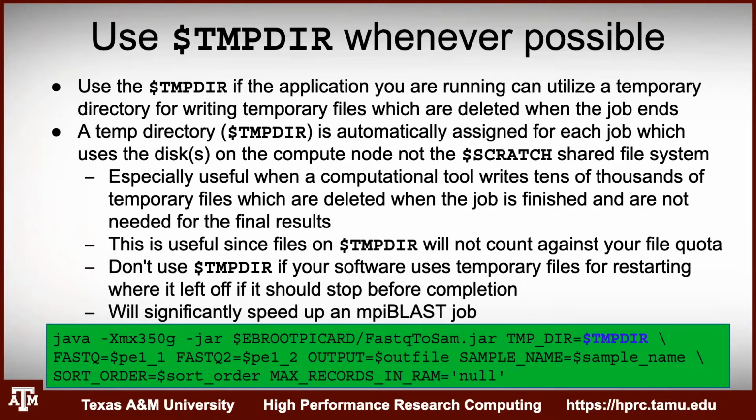Yes, and it can also do things like speed up whatever job you're running. Right here, Michael has this command typed out, doing a FASTQ to SAM file conversion, and here he assigns the temporary directory to $TMPDIR, and that's how you utilize that function. So any questions on that?